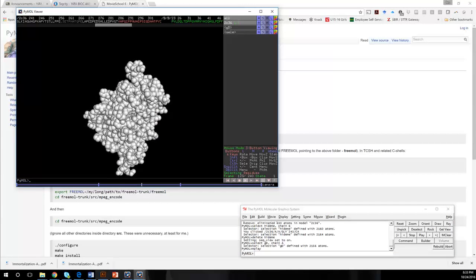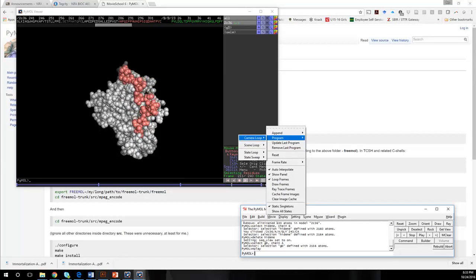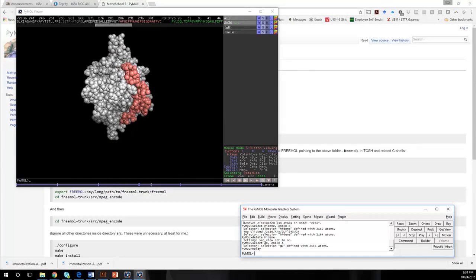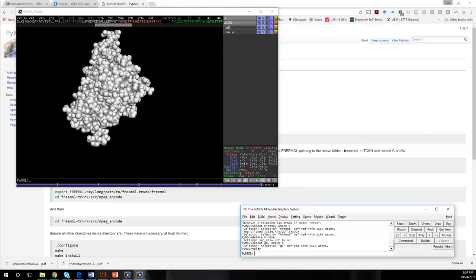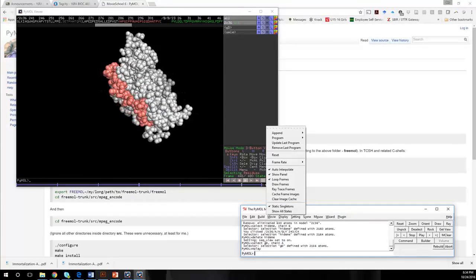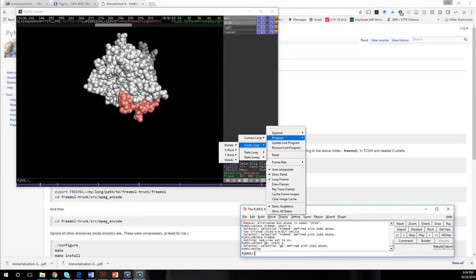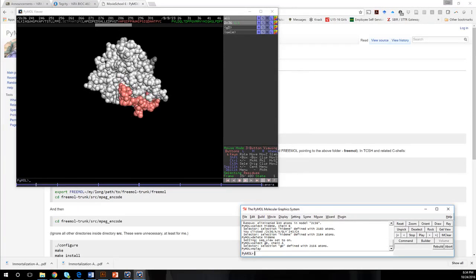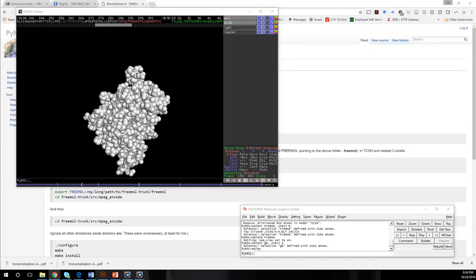So you notice down here it creates some scenes, and it's just going to go through those scenes. If I want to do a Y roll, I just go to program, camera loop, Y roll, 8 seconds, and it's going to shift it around that way. So then it's going to do around the x-axis, then around the y-axis. You can do the z-axis; it makes it look like a propeller. But that's a command line. I don't know that they have any z-axis in there, so I just made a steady state one. Okay, so in the example they also give you how to do rocking, and they show you how to nutate and all sorts of other things.